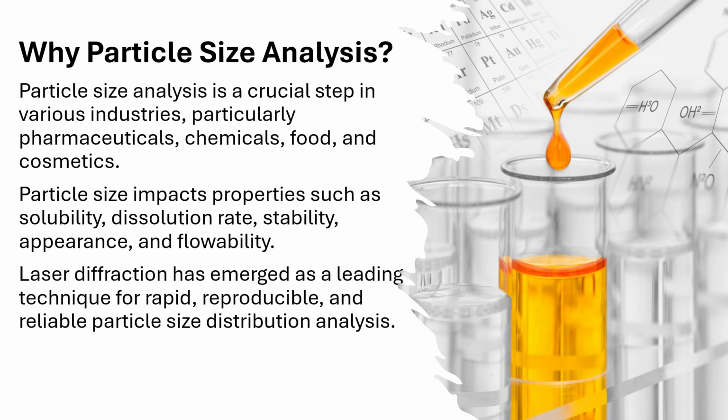In pharmaceuticals, it affects the bioavailability and drug release, whereas in food and cosmetics, it impacts the texture, appearance and stability. So the particle size analysis is a very crucial step, so that the final product will be of good quality, right? And laser diffraction is widely adopted because it covers a broad size range from nanometers to millimeters, offers high repeatability and delivers results within seconds, making it ideal for both R&D and production environments.